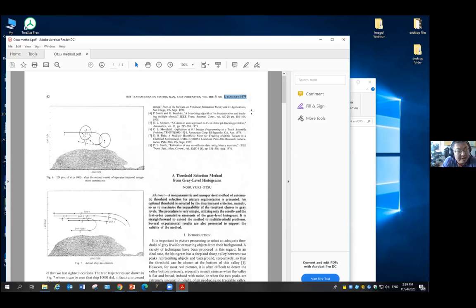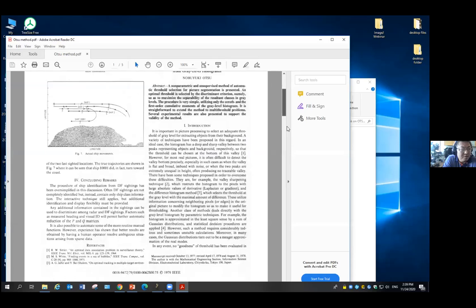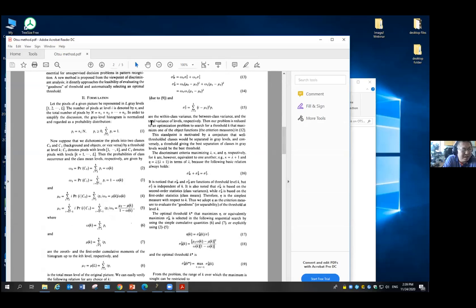So it doesn't necessarily mean it will work for your sample, but it works on many, many kinds of images. So I would suggest, when you have your image and try the thresholding algorithm, definitely try this one. And if you go down, you will see that this is how the paper looks. That's what all thresholding method papers look like.